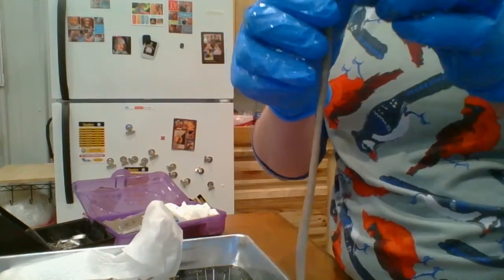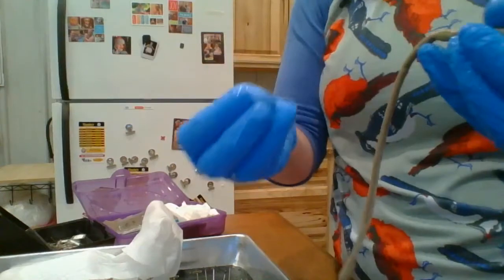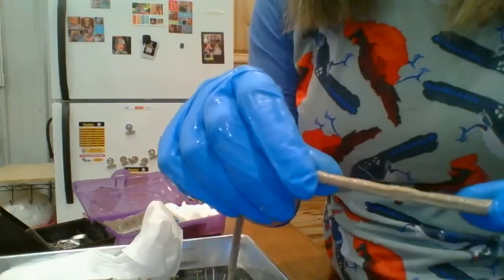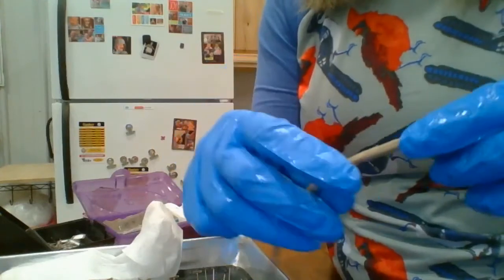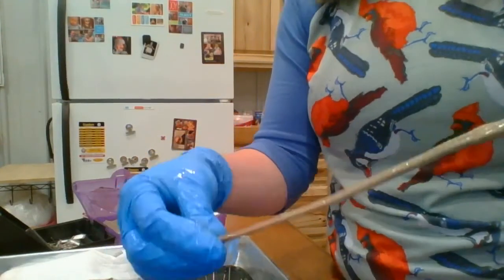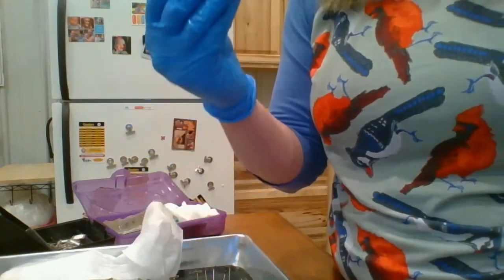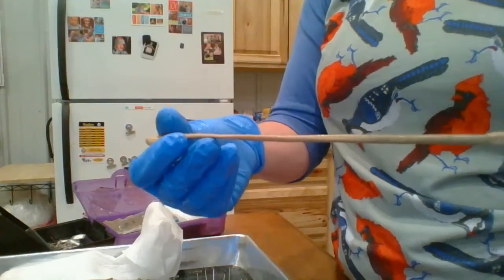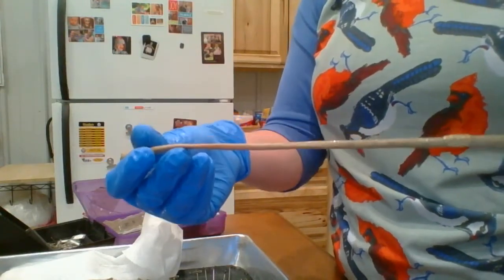It has the setae, which are those bristle-like things used for locomotion. I wish you could feel it. Just go touch a nail file, and you'll know exactly what it feels like. And then it also has on the outside these things called nephridium. Nephridium is your word of the day. I can't elaborate any more than that at the moment.